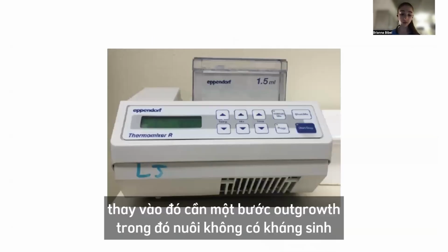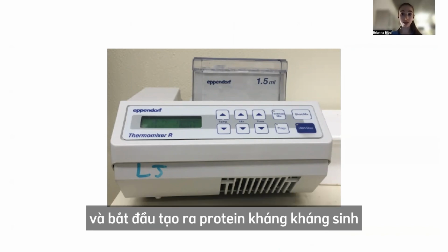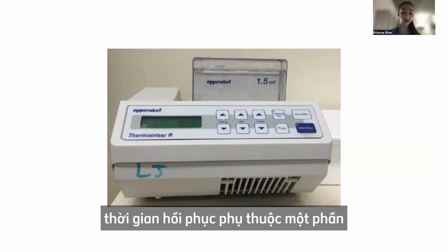Instead, you typically do an outgrowth step. In this step, you grow it in the absence of antibiotics for like half an hour to an hour, allow it to recover and allow it to start making those antibiotic resistance products so that it can avoid the effects of antibiotics before it gets killed off. So how long you let them recover is going to depend in part on the antibiotics that you use.